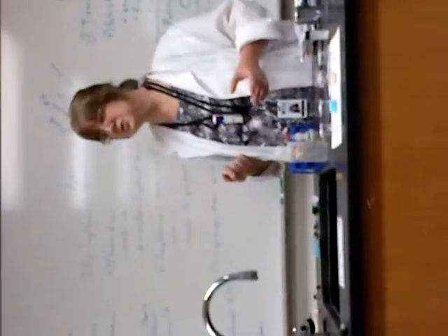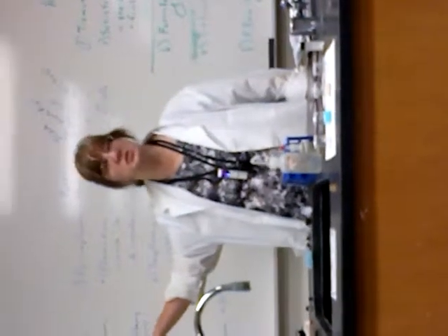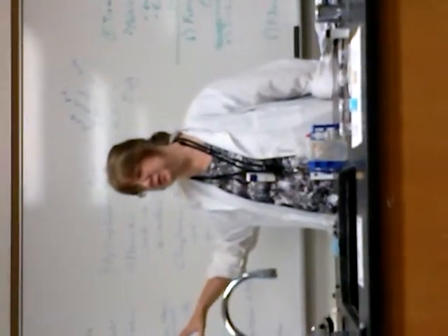That's not a horse. No, this is a form with all the other variations as well. A little bit close in. Okay? Those are your parasitic protozoans. Going back to my typical test, we'll give you a break before we head into the worms.